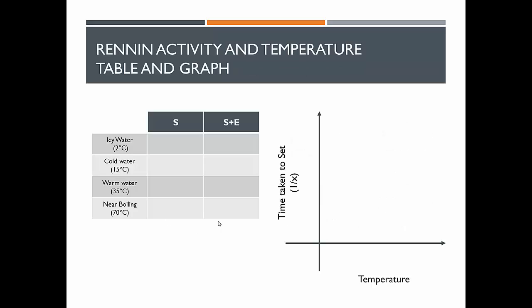Alright, well, let's have a look. This is something that I'd like everyone to get down on a nice neat sheet of paper before you start the experiment. We need to take measurements for both. So are we expecting the milk by itself to curdle in these temperatures?